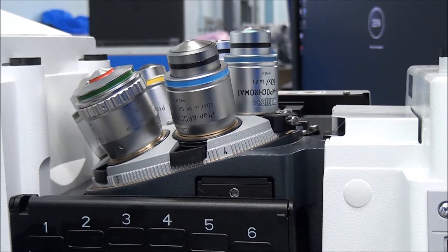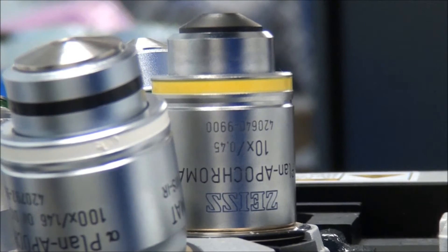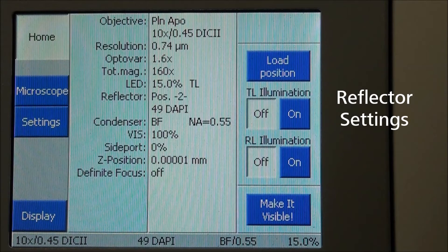Swing in the 10x objective or whichever lens you are using. Proper Kohler can only be set up for magnifications of 10x and greater. Make sure that your reflector turret is set to a bright field position, or a DIC position if no empty positions are available. Use the manual roll wheel or touch screen to do this.